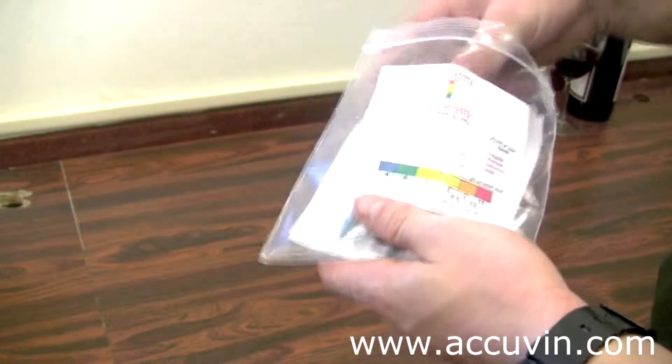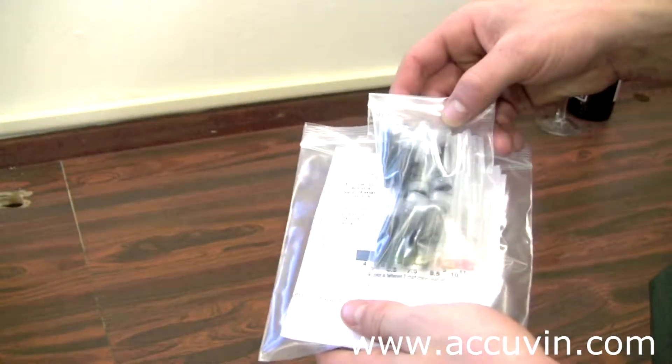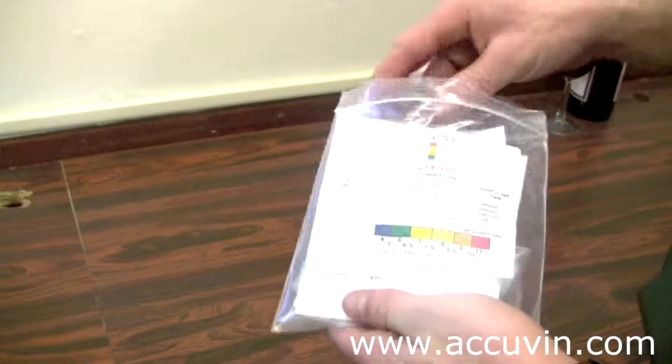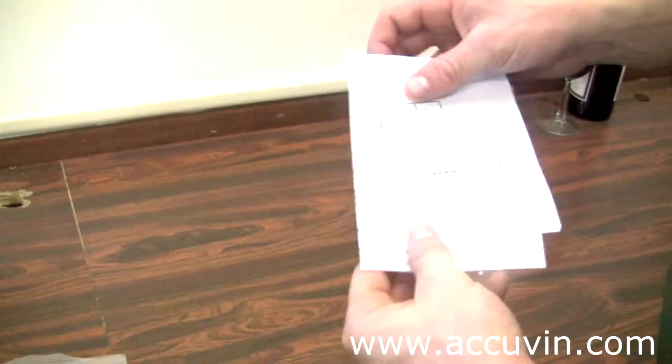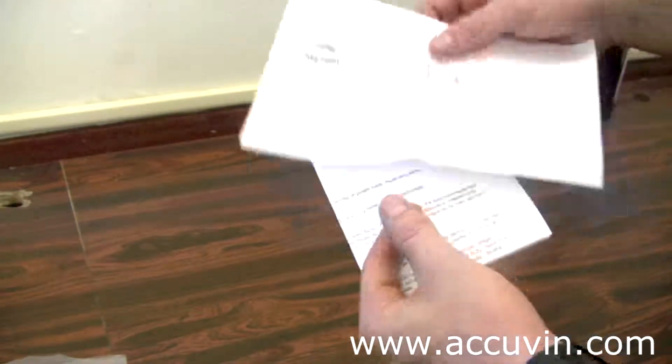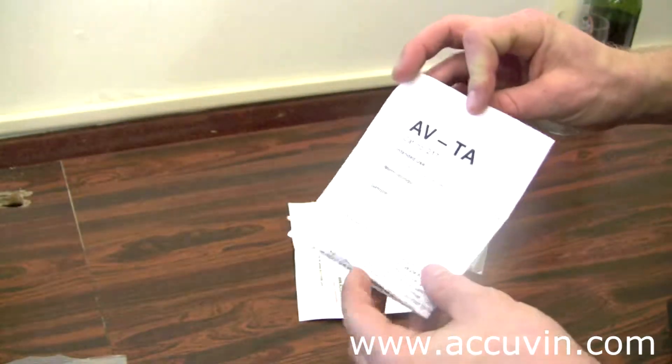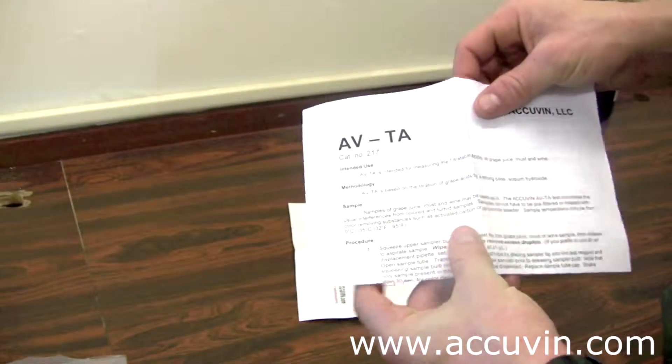Inside the TA test kit, you'll find the samplers and reagent tubes, and also an insert on how to do the test, and an insert on more information about TA.